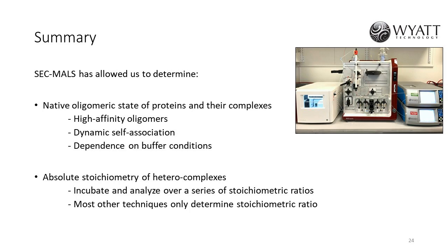Okay, thank you. Next question. At 300 millimolar NaCl, both yeast and worm NAP1 proteins are shown to be dimeric, but exhibit long tails in the SEC profile. Do those tails correspond to dissociation to monomers? And if not, why do they appear?